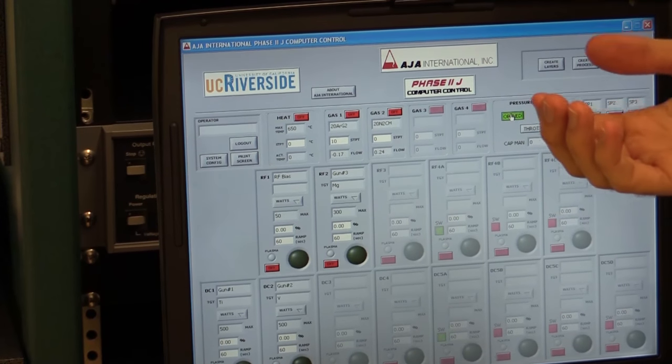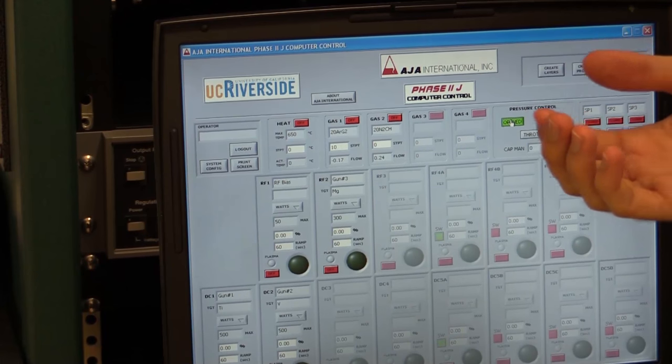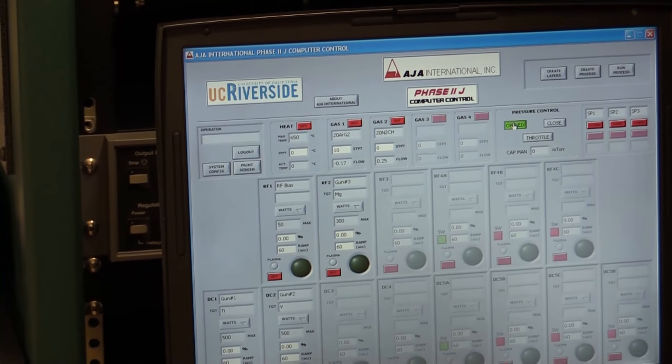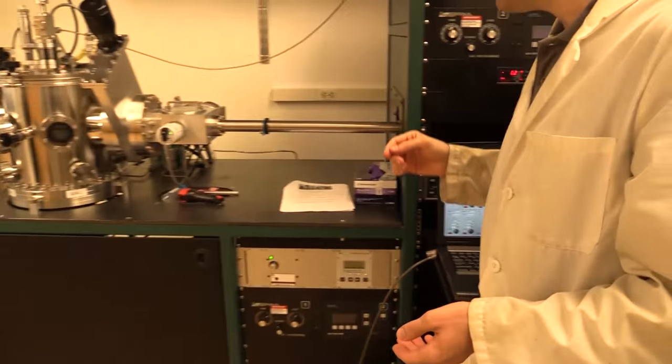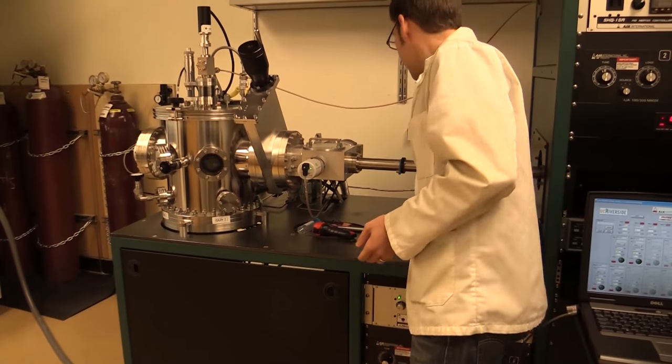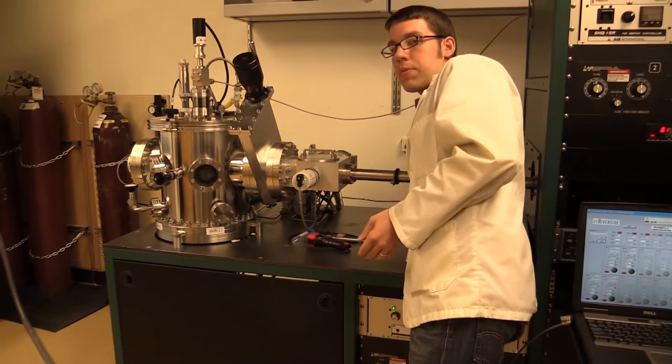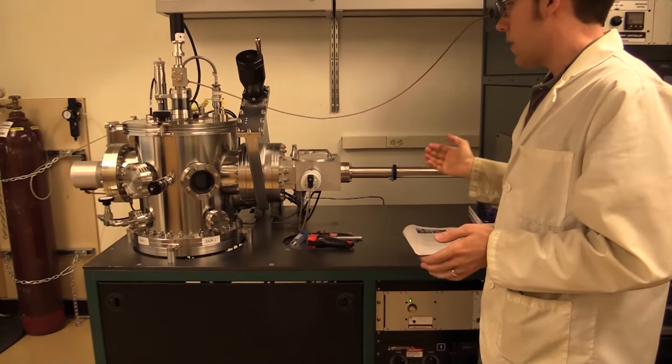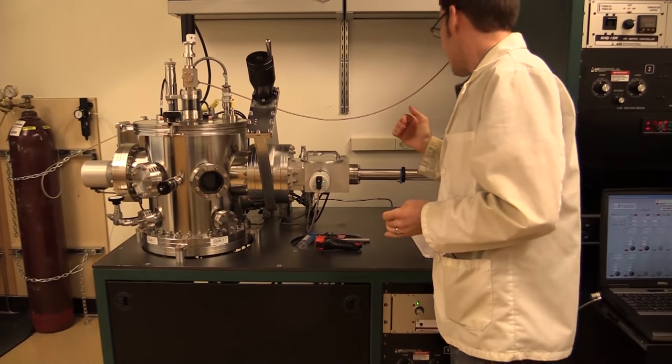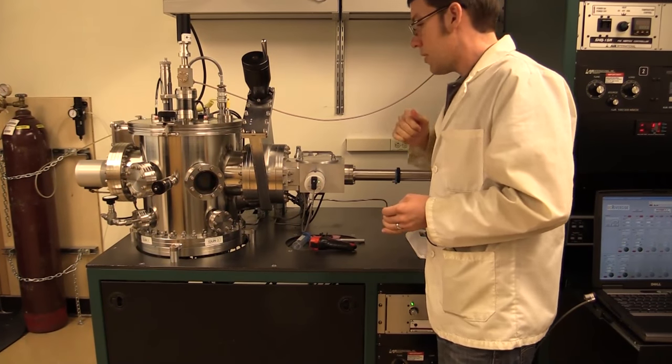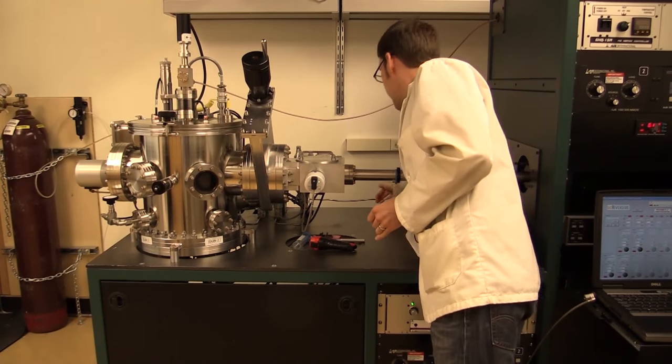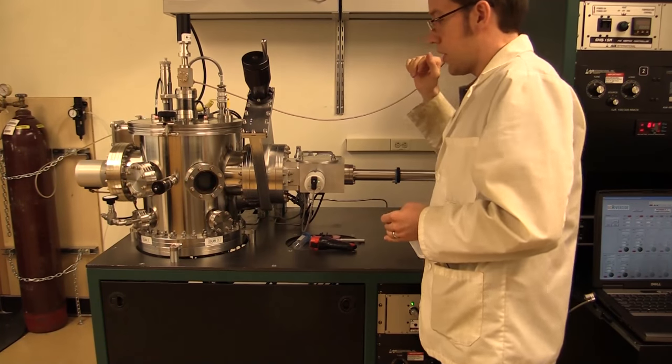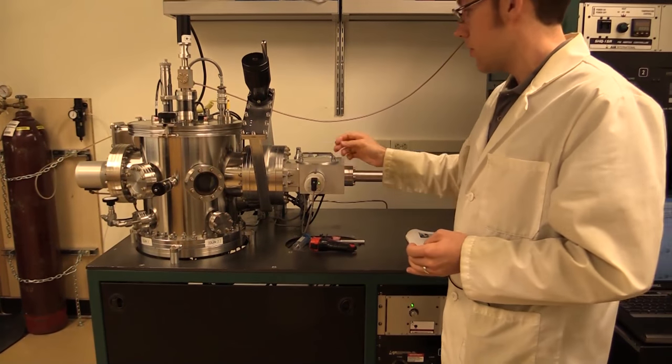To vent the load lock chamber, we need to open a shuttle valve which is on the back side of the sputtering system. I'll just point to it. It's back here. I'll rotate the valve counterclockwise to open, and at that point we'll have nitrogen gas to vent our load lock.